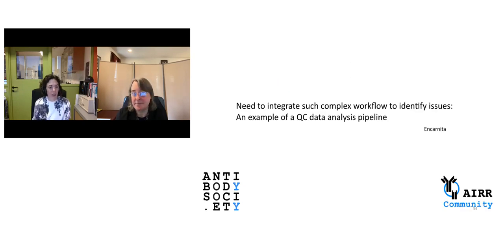So now I think you had the overview. Thanks, Nina, for showing us all these different approaches, all these different steps that need to be controlled. This is something that definitely alters the life of any AIR sequencer in the field. And what we tried to do in the lab was to integrate all those parameters from this very complex workflow to identify issues that could occur at any of those steps.